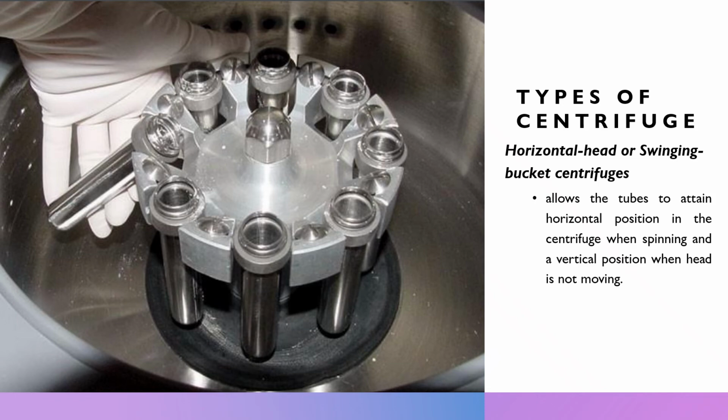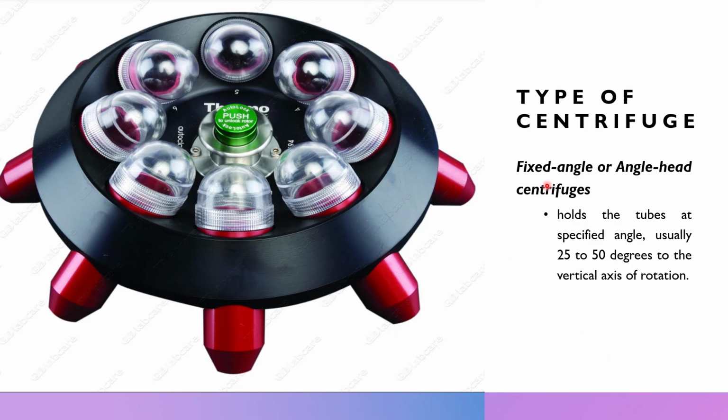There are different types of centrifuge. The first one is the horizontal head, or the swinging bucket centrifuge. This allows the tubes to attain a horizontal position in the centrifuge when it is spinning and a vertical position when the head is not moving. Another type is the fixed angle or angle head centrifuge. They hold the tubes at a specific angle, usually 25 to 50 degrees to the vertical axis of rotation. Usually the names of the types of centrifuges come from their positioning.